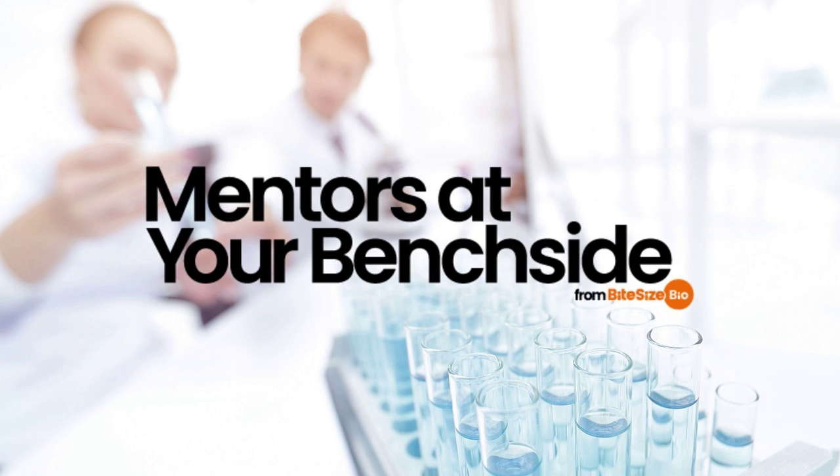The presence of reducing agents in your buffer can interfere with the assay, but there are reducing agent compatible kits available. While slower than the Bradford assay, the BCA assay is a great option if your protein samples contain up to 5% detergents. It also has a more uniform response to different proteins than the Bradford assay, although it's still strongly influenced by the presence of tyrosine, tryptophan, and cysteine amino acids.